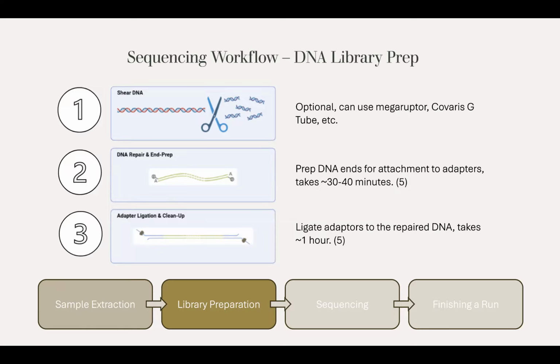And from front to end, not including all of the quality checking, I would say that this entire protocol takes about an hour and a half to 2 hours, a little bit less if you're practiced, which I think is really incredible, that this technology allows you to go from a plate of cells to a fully prepped library ready for sequencing in just a handful of hours.